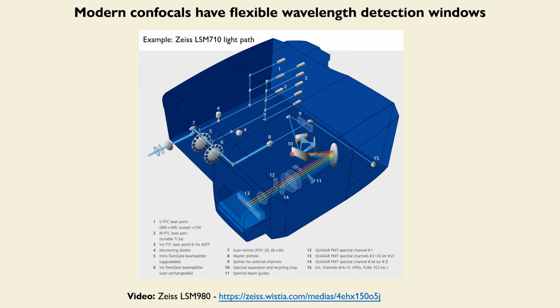Eventually it gets here. That's not super important how it gets here. Just trust me that it does. And this element is something called a diffraction grating, which when you illuminate the diffraction grating with light with multiple wavelengths, it separates out those multiple wavelengths into spatial positions.